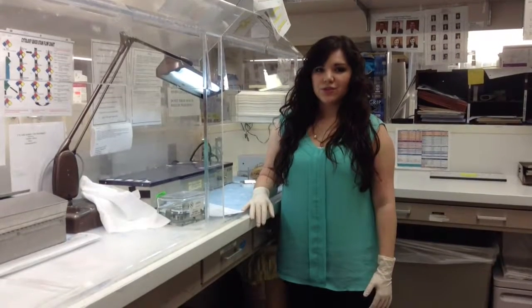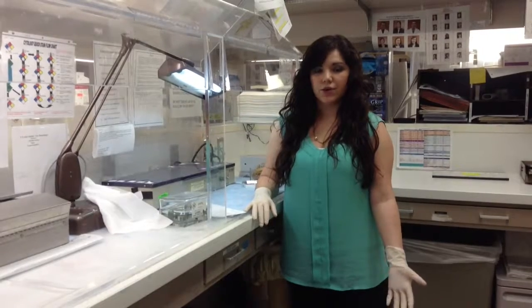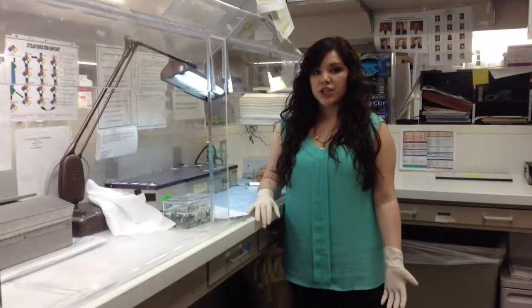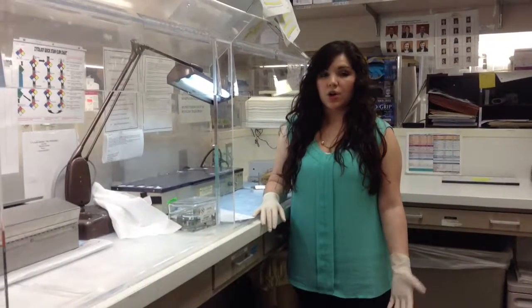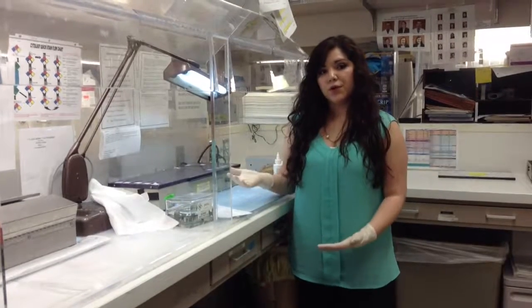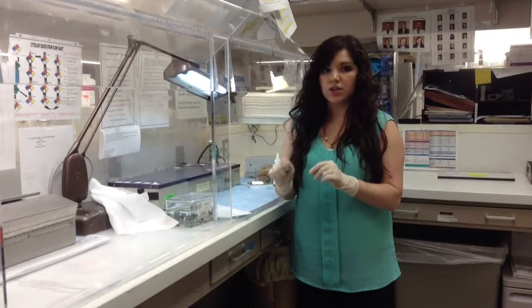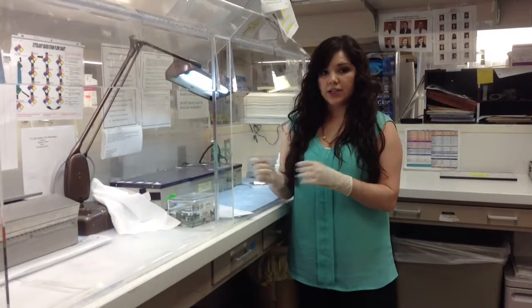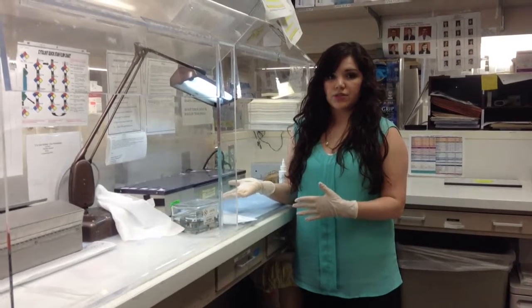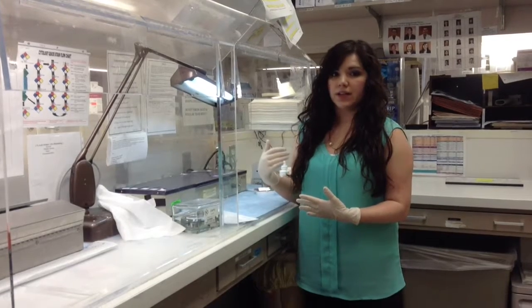For day 4 of the student summer rotation, you will be teaching the student how to process brushings of all types, including GI tract brushings and bronchial brushings. Additionally, you will teach them about sputum specimens, although we do not typically receive those in our laboratory. I think it is important for you to go over the process of actually dislodging cells from the brush into our cytology specimen. If you do not have the opportunity to do this due to lack of specimen, please feel free to pull from our finalized cases.